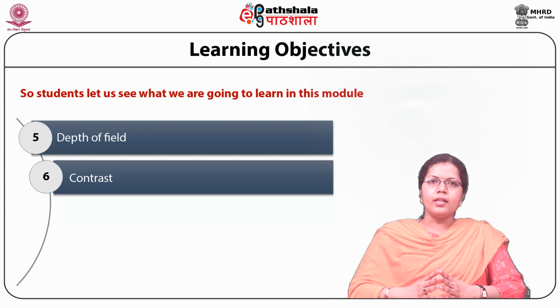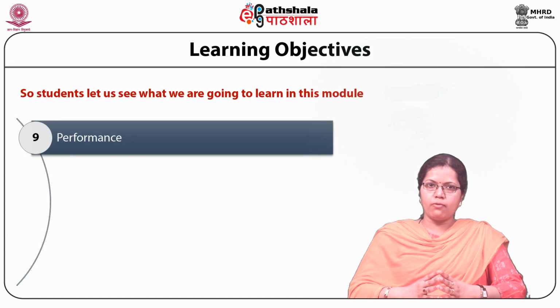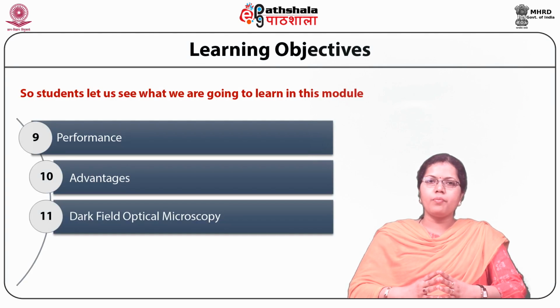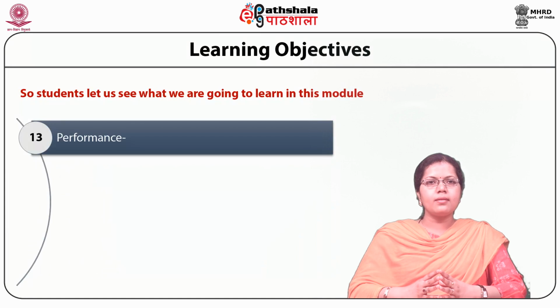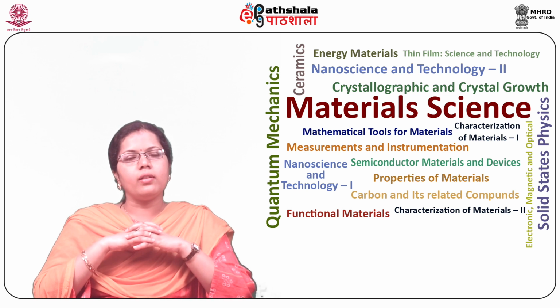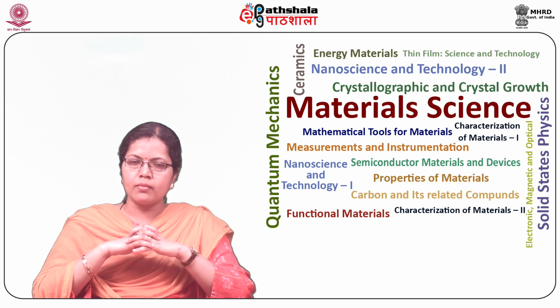Secondly, we will study bright field microscopy, in which we will cover the light path, performance and advantages. Thirdly, we will study dark field optical microscopy, in which again we will cover the light path, its performance and advantages. First of all, let us study optical microscopy.